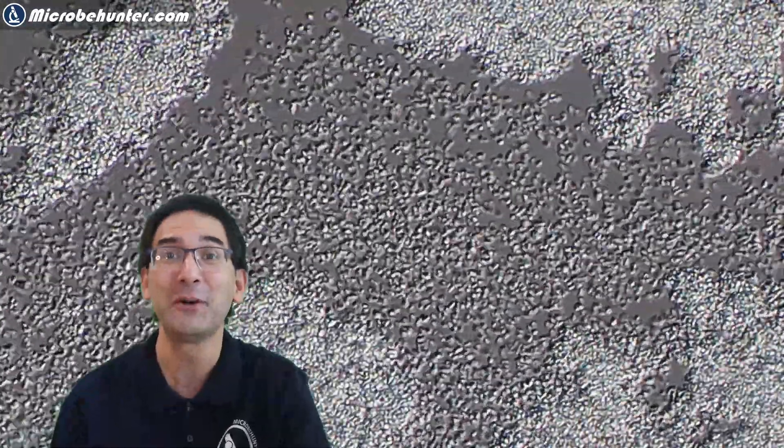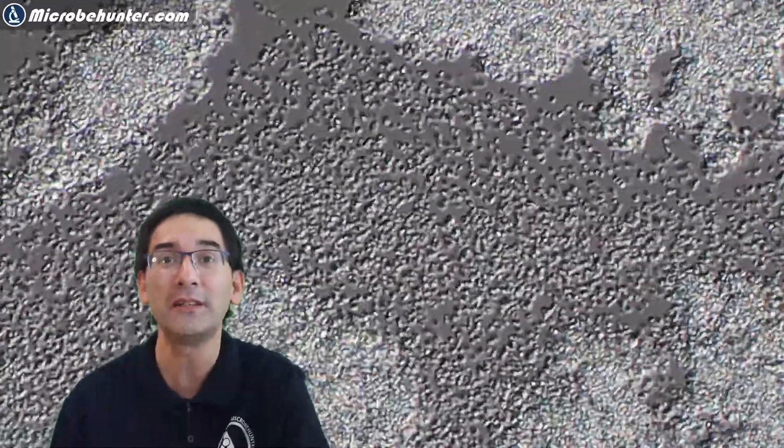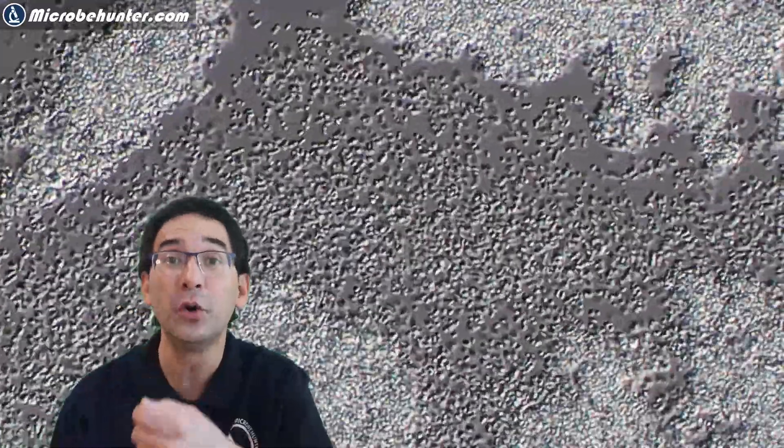But today I'm going to show you a very safe source of bacteria — not only safe, I would even say possibly even healthy — because I'm going to show you how you can take a pure culture of yogurt bacteria.